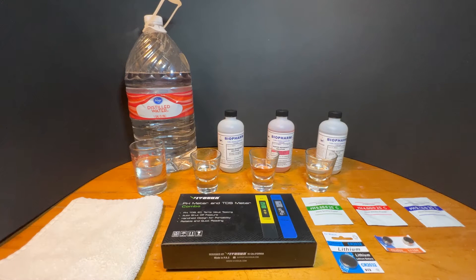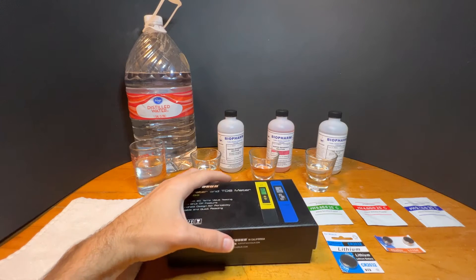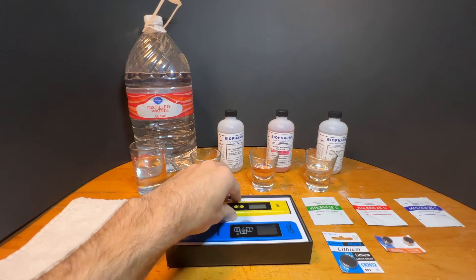This kit comes with batteries both in the meters and backup batteries in the box. It also comes with one-time-use PH calibration powders in 6.86, 4.0, and 9.18. These powders get mixed with 250 milliliters of deionized water until fully dissolved.